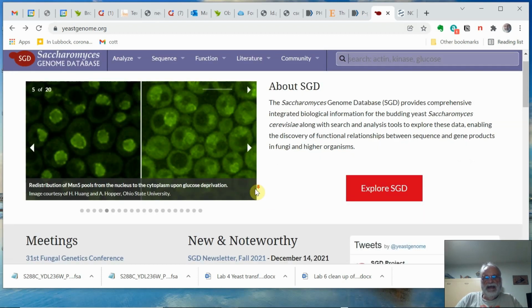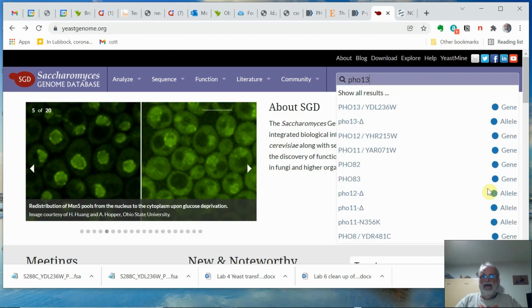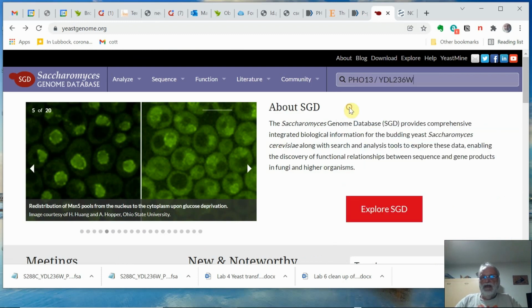What I have here on the page is the yeast genome database, the Saccharomyces database. It's got a lot of information in it. You might want to just look around at it. But the gene we're most interested in right now is one called PHO13. I'll probably call it FO13 in future videos. So I'll click on this FO13.